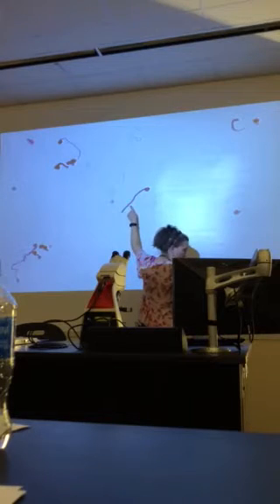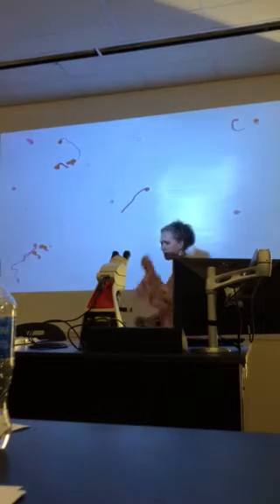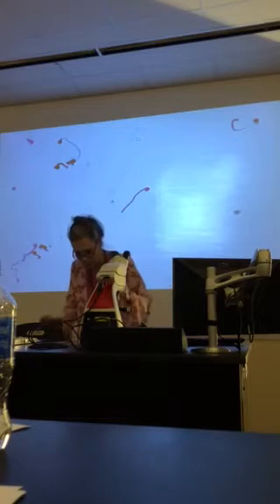What would I call that long structure? That would be a pollen tube. Very good. That's my pollen tube. I'm seeing a whole bunch of slides over here. Let's move over here.